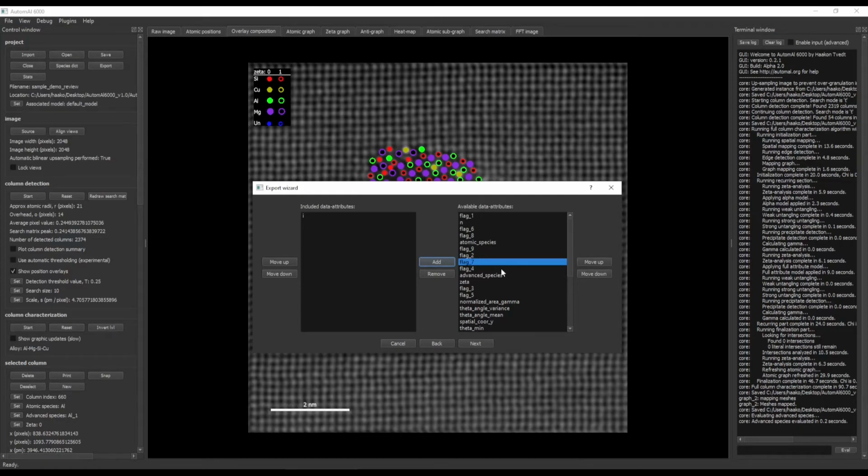And then perhaps you would like the spatial coordinate, and spatial will give it in units of nanometers, or picometers, I don't recall, but it's relative to some random point.